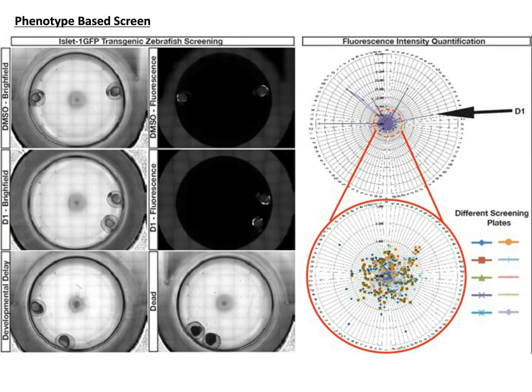So basically all cranial neurons glowed green, and we did a screen where we took bright field and GFP images. The bright field imaging helped us identify compounds producing different developmental toxicity like cardiac edema or developmental delays or developmentally lethal. And the GFP, as shown on the right side of the slide, was then quantified.